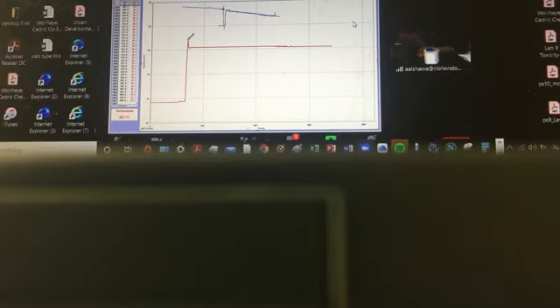I guess a few beads came in and made contact. If this is the thermometer, and that's the sensor portion of the thermometer, a few beads at around 90 degrees straight contacting the sensor will jack up its temperature, though it is still surrounded inside the water. That will give us hotter values, which is not acceptable. So these are artificial jumps. They're not part of that curve. Most likely the curve is going to bend at around this area.